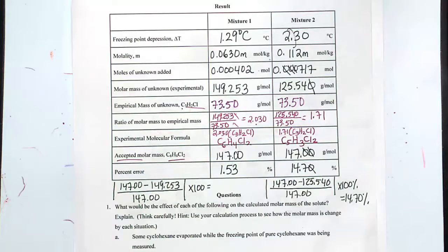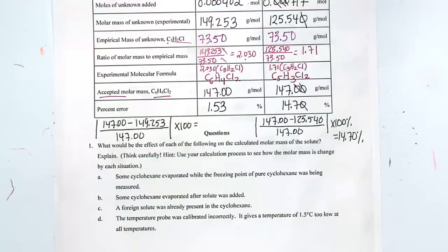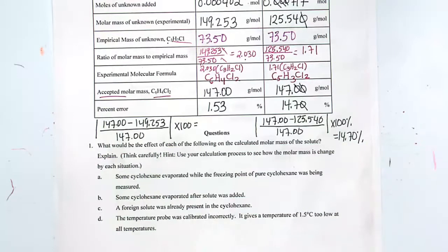But this is the walkthrough on how you do your data. Your data and your numbers are obviously going to be a little bit different, but this is how you're going to do a similar type of calculation for your post-lab analysis. Figure out this question here in terms of errors. What happens if there's some sort of contamination or evaporation that occurs? The first question here is some cyclohexane evaporates while the freezing point of pure cyclohexane was being measured.